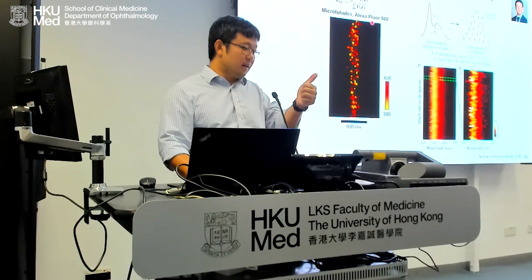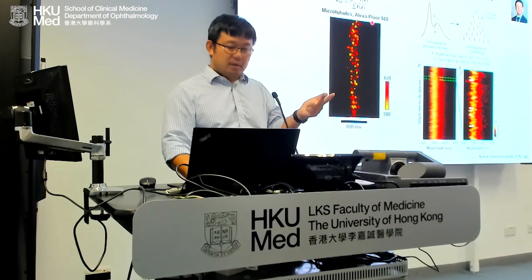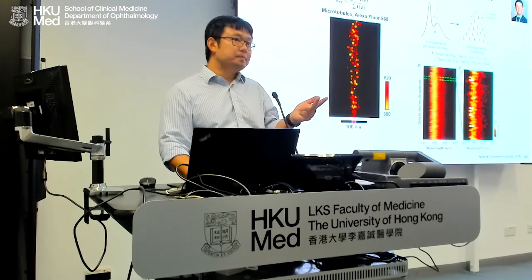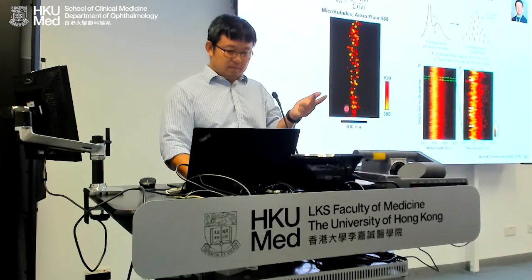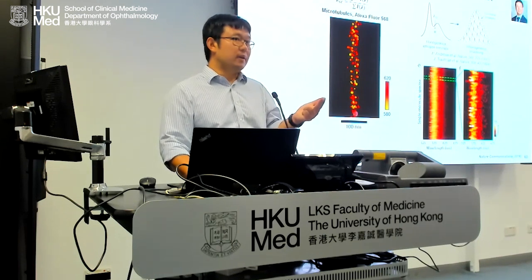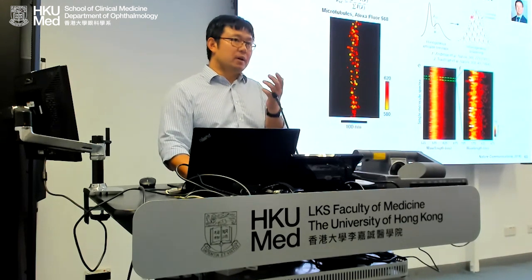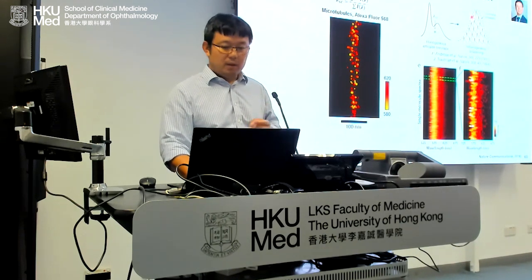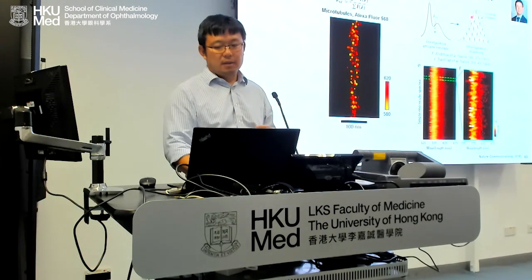So it's the same dye. It's the same cell organelle in the same cell, but the color looks different, right? It's the same dye, same cell, same cytoskeleton, but the color looks different. Why? What makes them different? Essentially, if any of you are doing fluorescence microscopy, you will get an excitation spectrum and emission spectrum from the manufacturer.